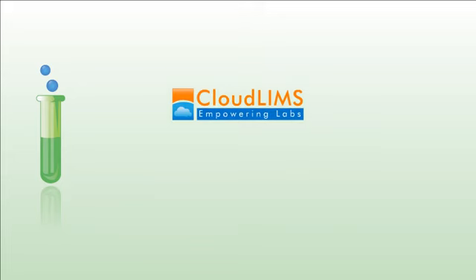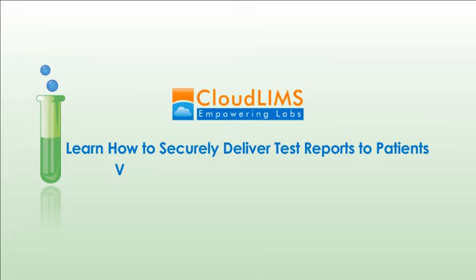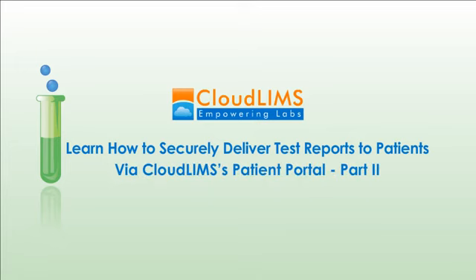In this video, we will walk you through the process of securely delivering test reports to patients via CloudLIMS's patient portal. This video picks up where we left off in part 1 of the tutorial. We suggest that you watch the first part of the tutorial before watching this one.